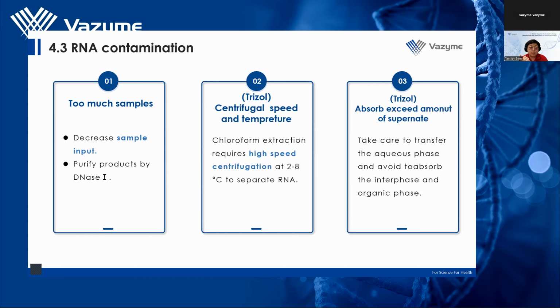Another reason could be taking too much supernatant during Trizol extraction, which can lead to contamination. If that's the situation, reduce the volume of supernatant taken during the phase separation to avoid aspirating the interface and organic phase.